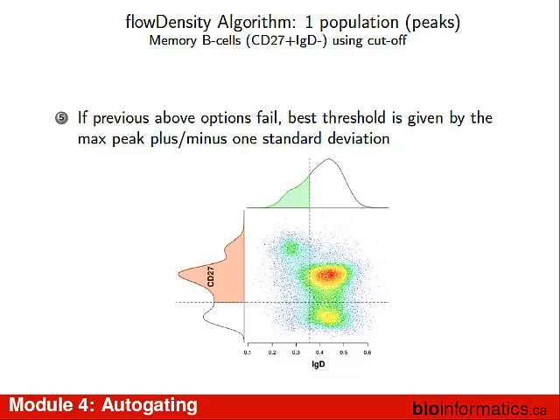If you have some FMO data, I would love to have it today. We don't have that in the flow density package right now, and before we publish, it'd be really simple for us to add one extra step: here's my FMO sample. Thank you. Well, we have unstained, but is it? No, I know it's not the same. Come on down.